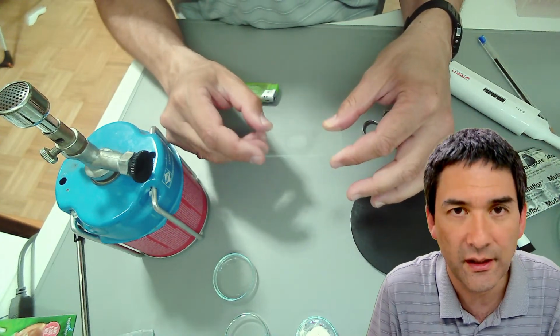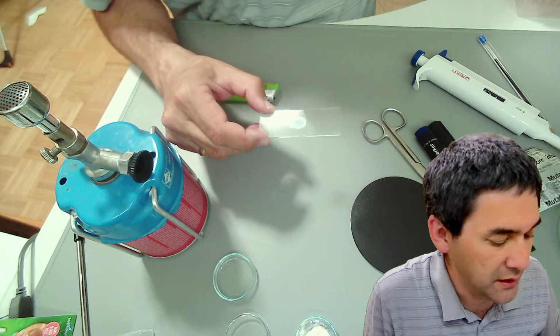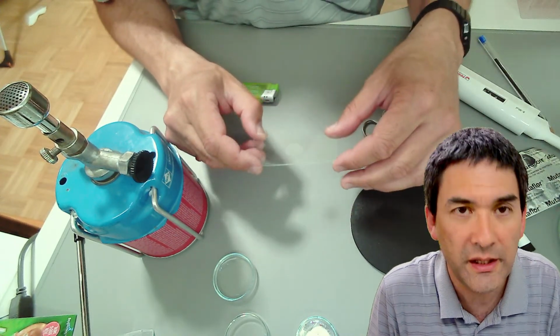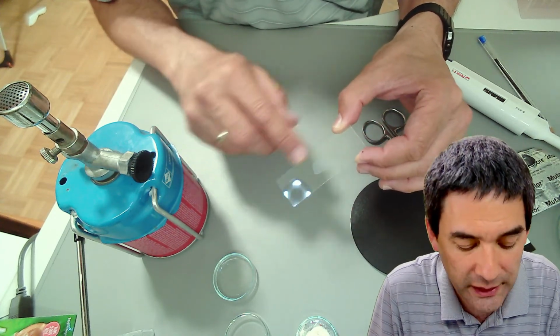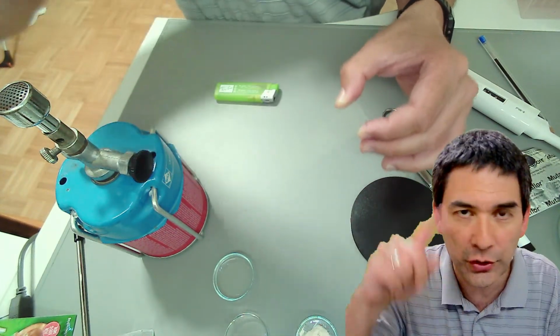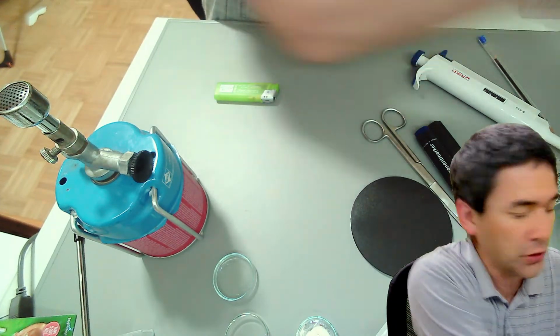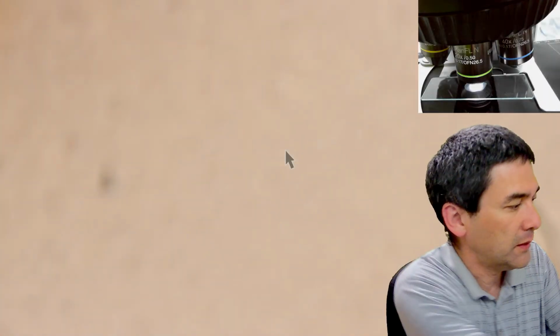Let's have a look at this now. Okay, and we're going to see that hopefully the bacteria are now more easily visible because they're all in one plane. They're all spread across the surface of the glass slide, so they cannot move vertically anymore. And this should make it easier for us to actually see the bacteria. So where is it? The microscope view. I have to, of course, get everything back into focus again.